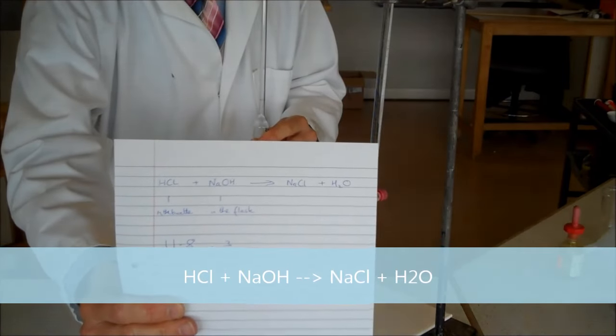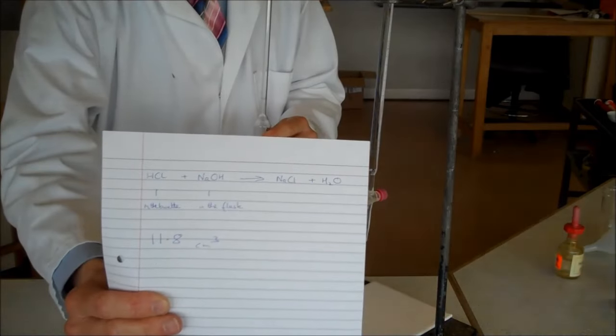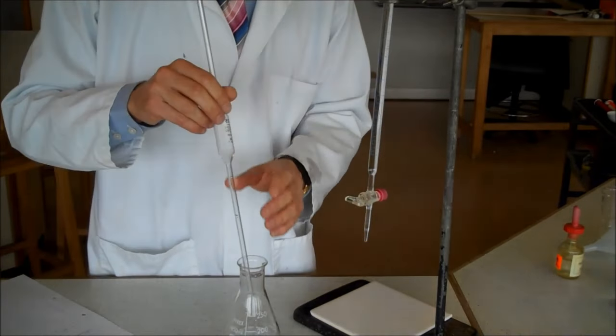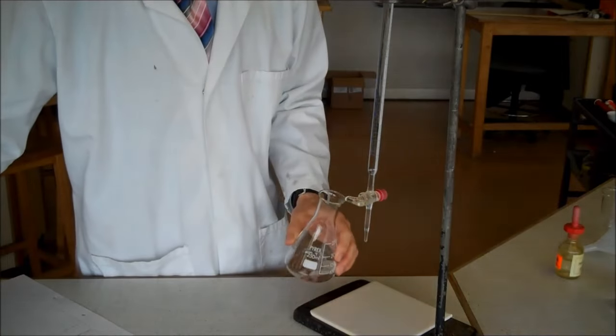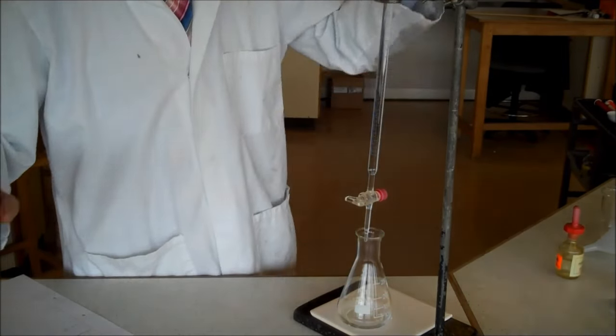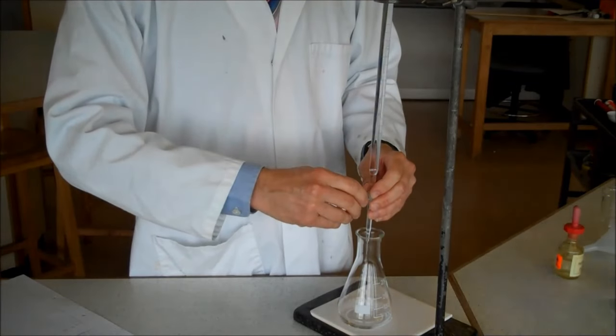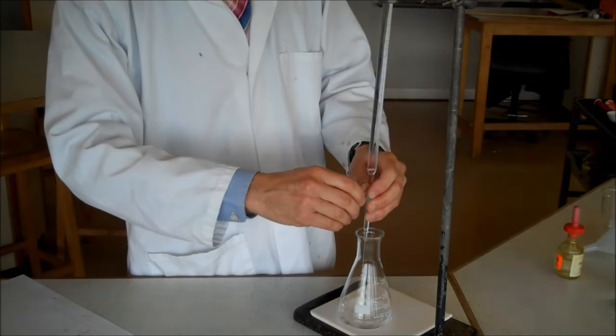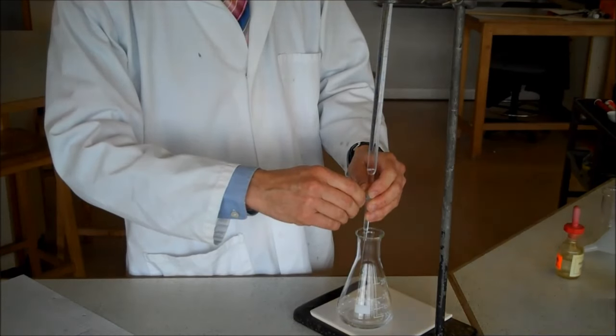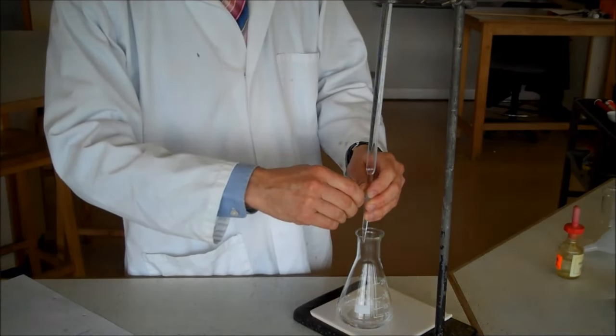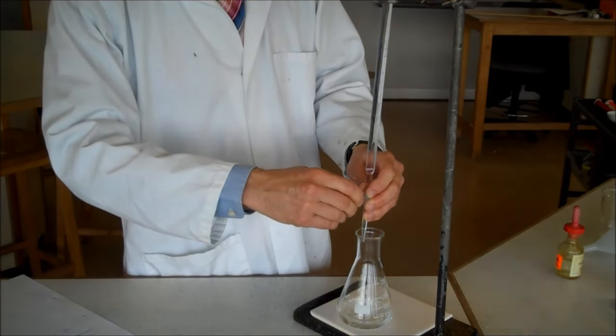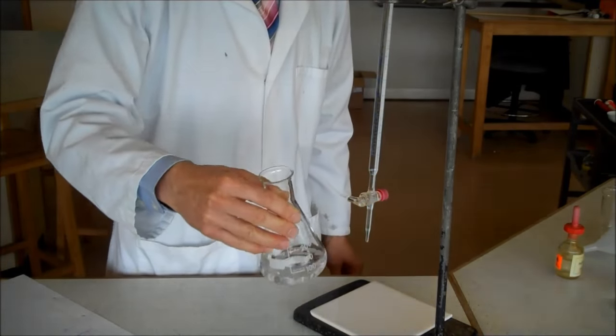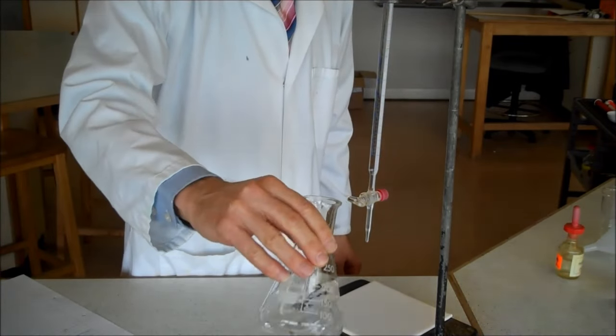Now if I'm trying to make a salt, I don't want phenolphthalein to be in there as well, because it's just contaminating the thing I want to make. And what's more, phenolphthalein is poisonous. So we certainly don't want that in there. So this time, I've got my alkali. I'm just going to run acid in until exactly 11.8 centimeters cubed have been added. I don't need to stir it at the moment. It's important just to add the right amount. And you can't see it from there, but I've now added 11.7, 11.8. One last drop for good measure. Swirl that around. And that is a neutral solution of sodium chloride.